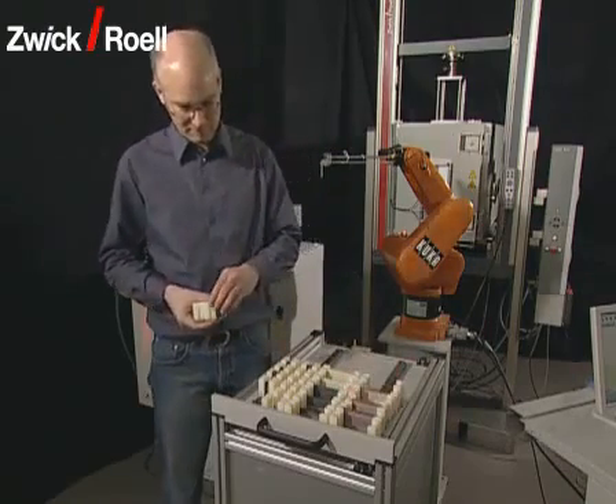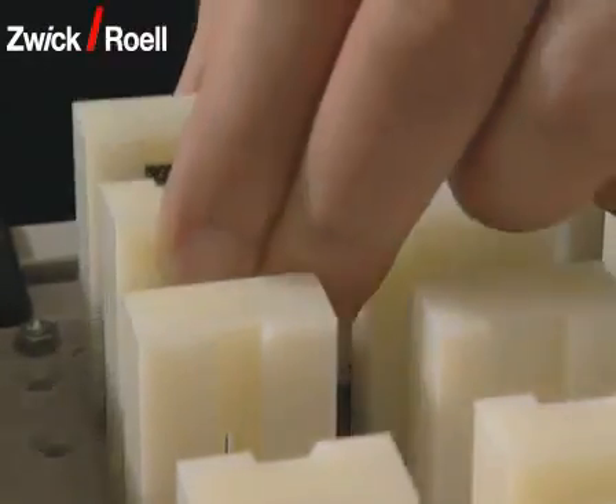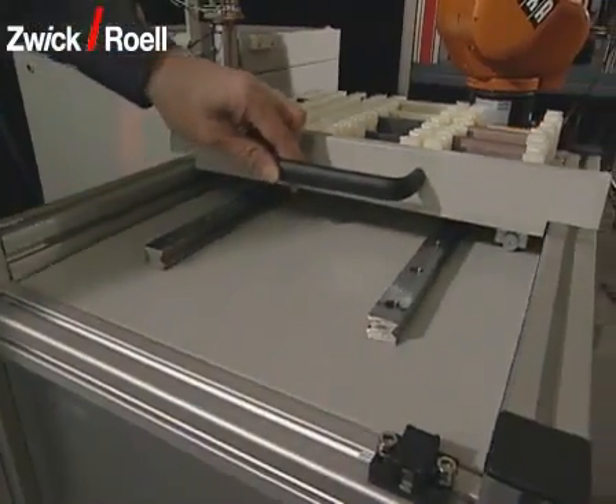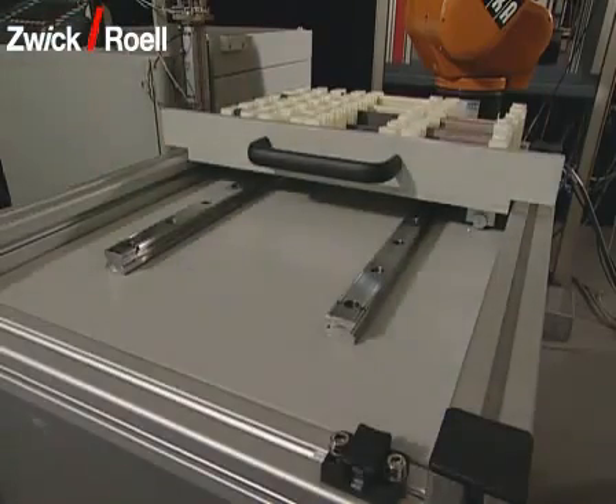A specimen runs through the following sequence. Firstly, the operator sorts the specimens into a removable carrier. By pushing in the drawer, the specimens are brought into the working range of the robot.